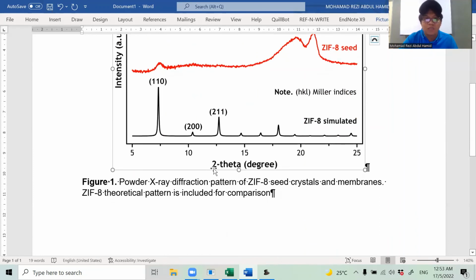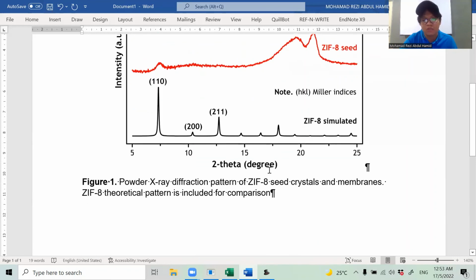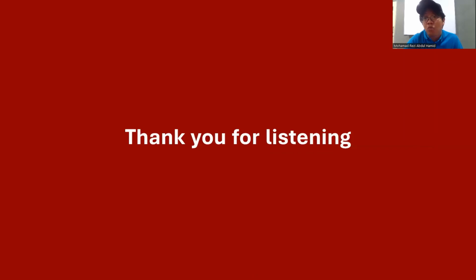So yeah, that's pretty much it on how to create the figure and then transfer it to your Microsoft Word processor, for example. All right, guys, I hope you learned something today. I hope you learned a new and cool software that can be used to create your own plot. I hope you take advantage of this software, because it is free, and try to spend time to make a nice figure.